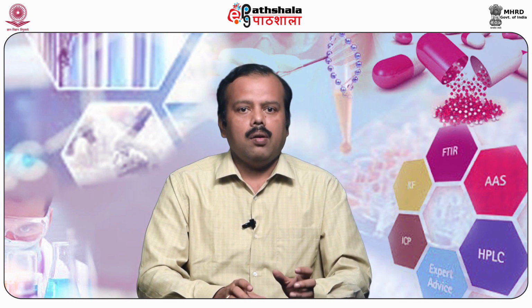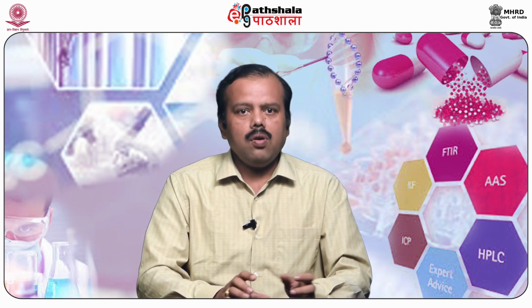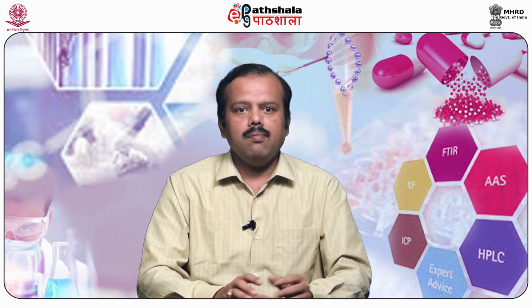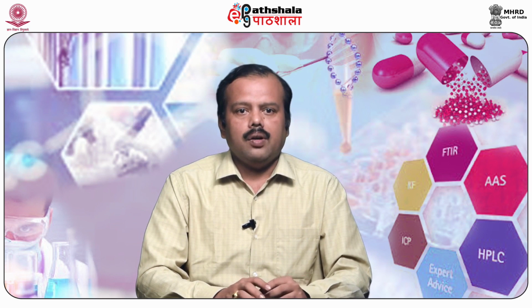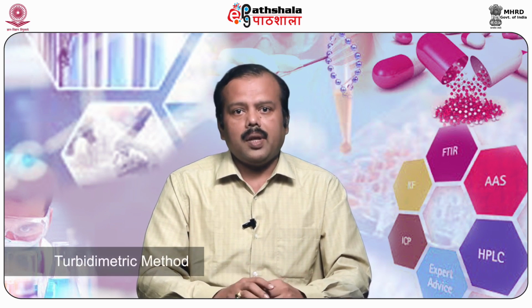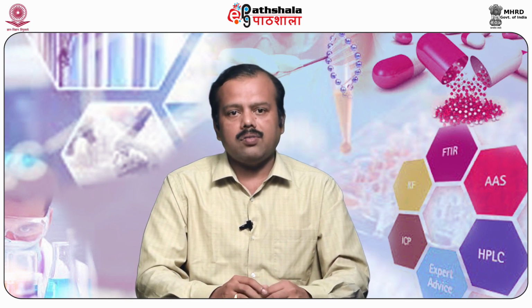For cylinder plate or cup plate method, that is method A, selection of test microbe. The inoculum is inoculated in a media plate. The cylinder is filled with medium concentration of antibiotic solution and incubated. After incubation, measure the zone of inhibition. The volume of suspension that produces an optimum, clear zone, and the diameter of the zone determine the inoculum to be used. For the turbidimetric method, or method B, selection of test microbe is carried out. The microbe or the inoculum is selected based on the optical density obtained between low and high antibiotic concentration.